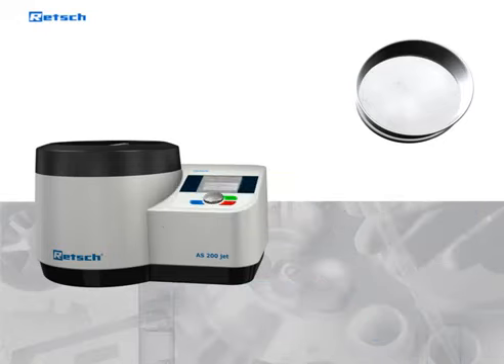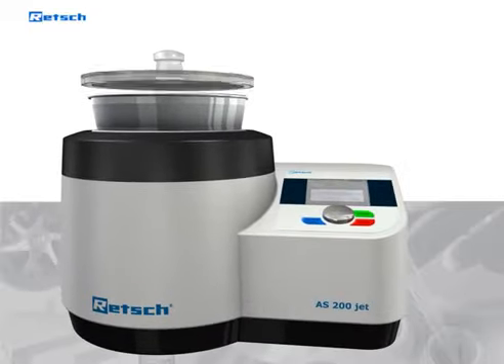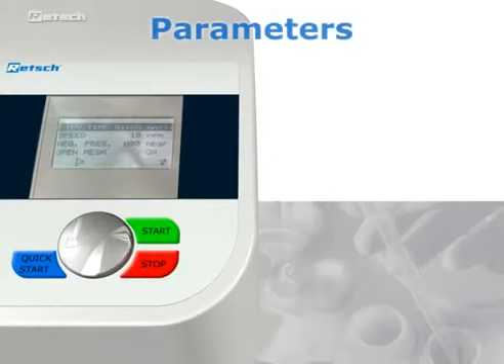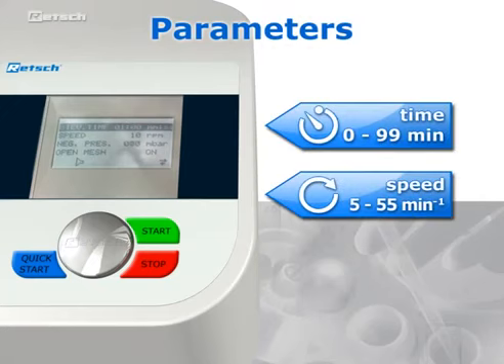A typical airjet sieving process begins with the placement of the sieve on the nozzle compartment. The sample is then poured on the sieve mesh and the dust-tight cover is placed on top of the sieve. When the required parameters such as time and revolutions per minute have been entered, the sieving process can be started.